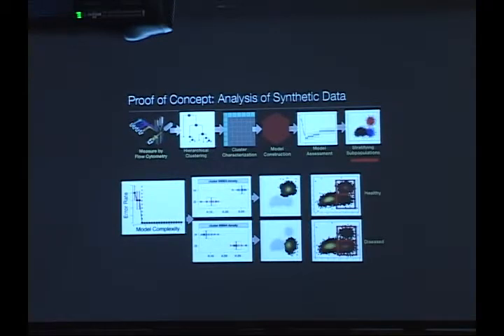I thought you said unsupervised. Sorry, I did. So the discovery of the cell subsets is unsupervised, whereas Federico's approach uses this prior understanding of cell types that exist in your data to help guide the layout of the tree, at least initially.